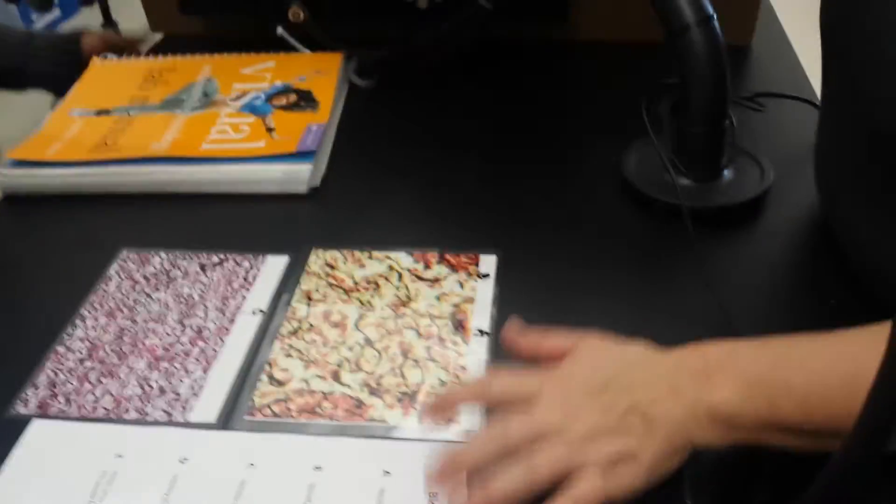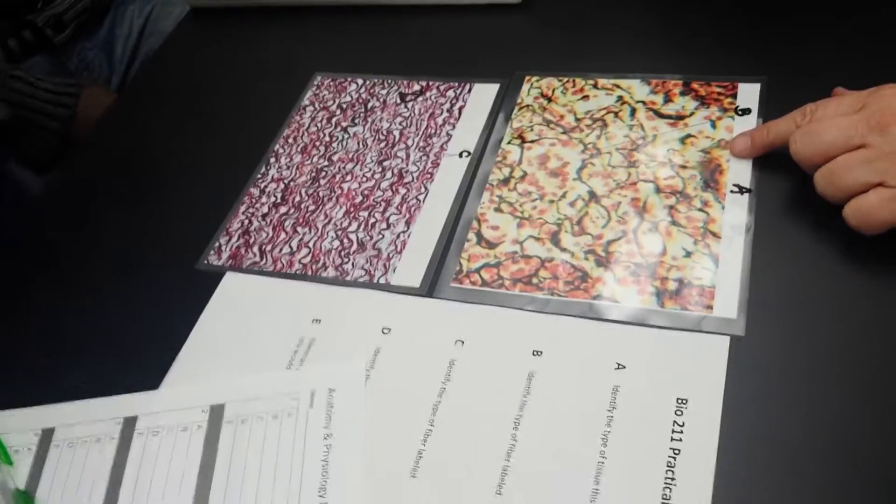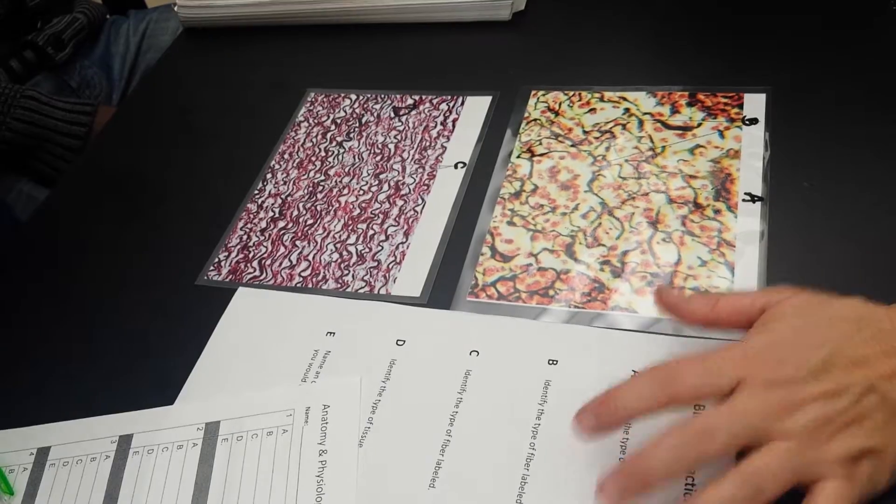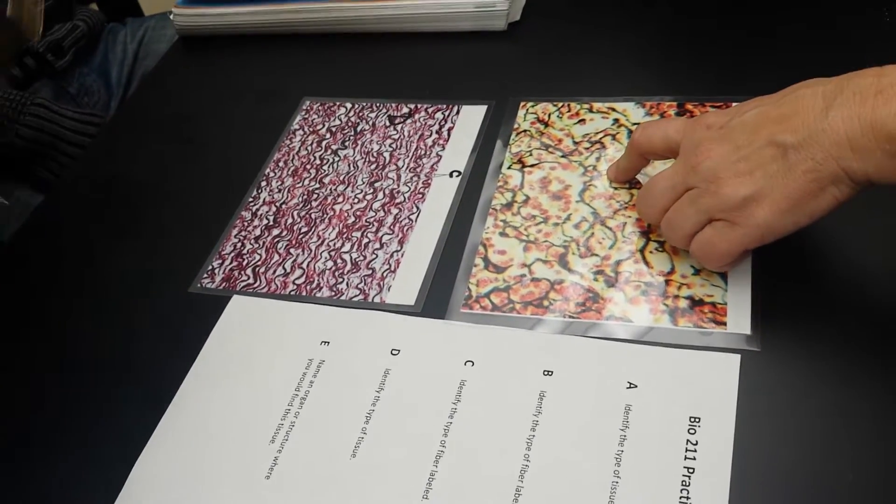Station C. Identify the type of tissue, this is reticular tissue. Identify the type of fiber, these are reticular fibers.